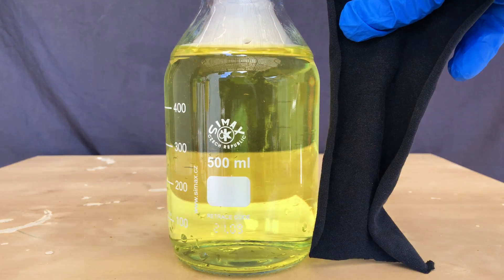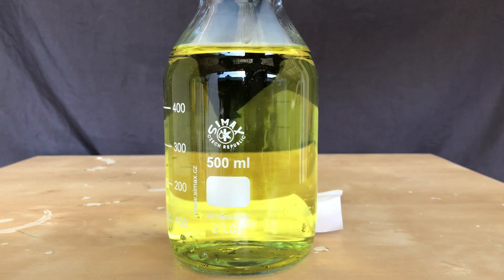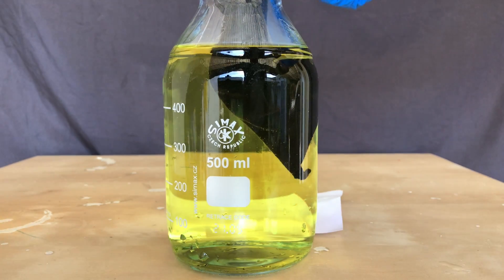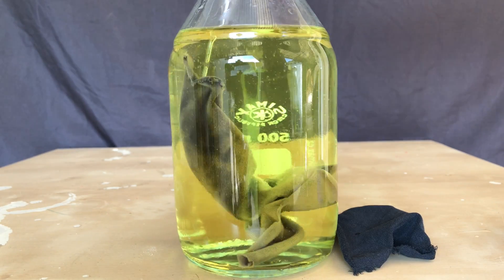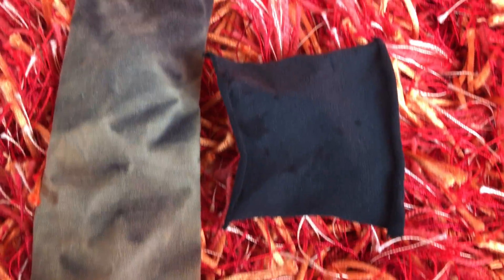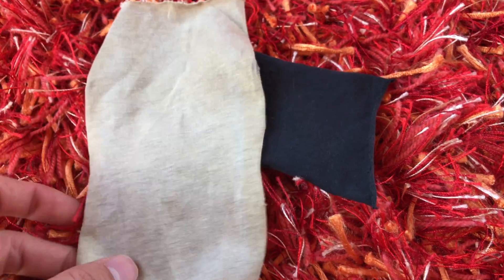Chlorine dioxide can be used to bleach things, and I'm going to show that to you. A small piece of black cloth was lowered into the chlorine dioxide solution and left in there for about an hour. Because chlorine dioxide is a gas, the solution can't be that concentrated, so sodium hypochlorite is still a better bleaching agent. The chlorine dioxide did a great job at bleaching the cloth, but I decided to put it back in for another 3 hours, after which it looked even more bleached.